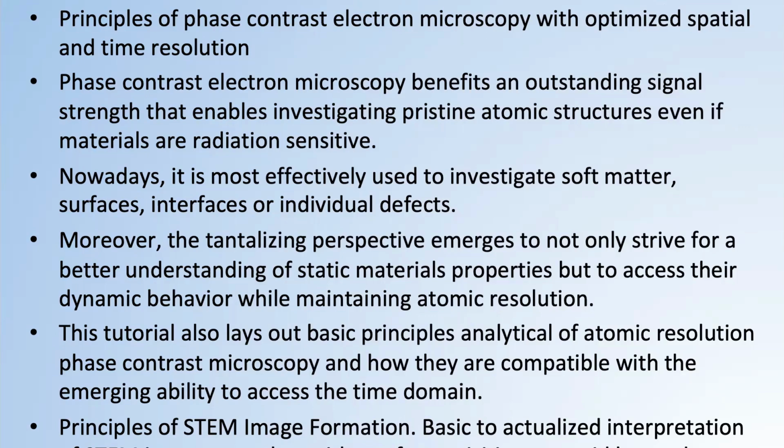Of course, there will also be a discussion on the principles of scanning transmission electron microscopy image formation, basic to actualize interpretation of STEM images together with a safe acquisition to avoid beam damage to a sensitive sample.